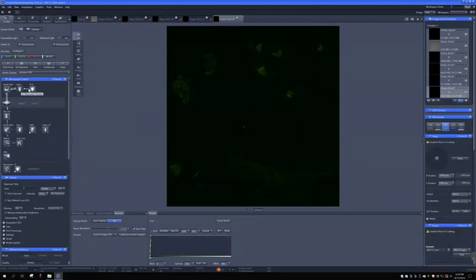And then we need to open this path. So here, the light path is telling you where the light is going through. It's going from the top to the cell, then to the objective, and then to the camera. Here I'm going to use none for the reflector because it's wide field. If you are using different fluorescence light, you need to choose the right reflector. Okay, so let me reset the system every time. Now you can see the light path is going through here to the sample, to the objective, and then to the camera. So in this case, it's going to the camera, so we can do live imaging on it.